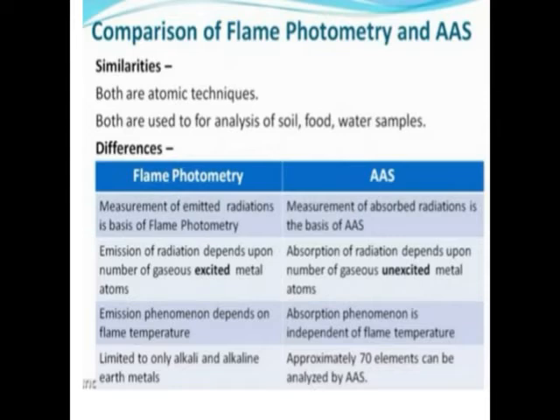During that they emit energy, which is measured. But in case of atomic absorption spectroscopy, what happens? The elements which remain in the ground state absorb radiation from the radiation source, and that absorbance is the principle behind the analysis of elements using atomic absorption spectroscopy.